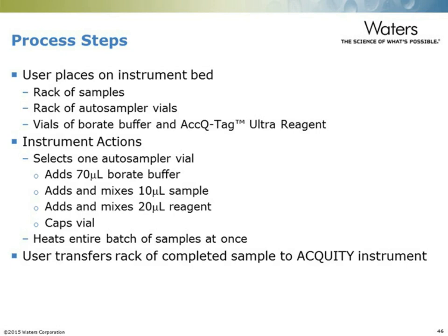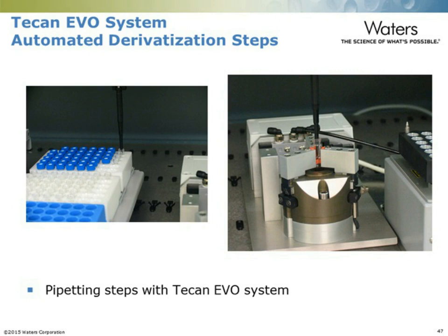When it's added the reagent to all the vials that are scheduled, it heats the entire batch of samples all at once. The user then takes that rack of completed samples to the ACQUITY instrument. The results, of course, of this process are the same.